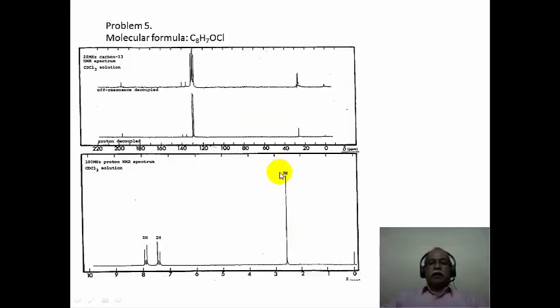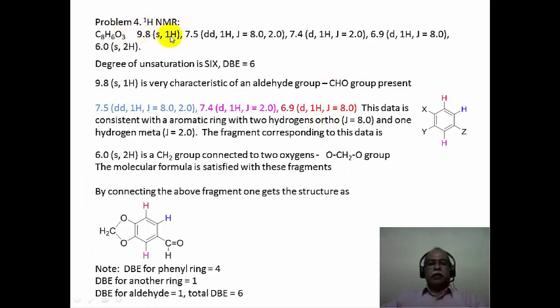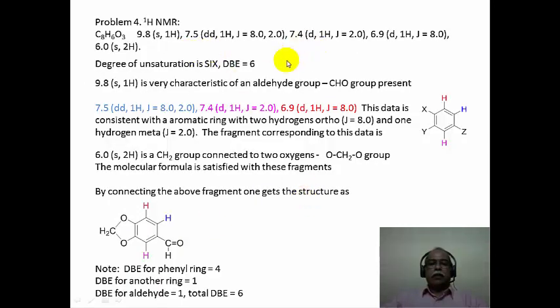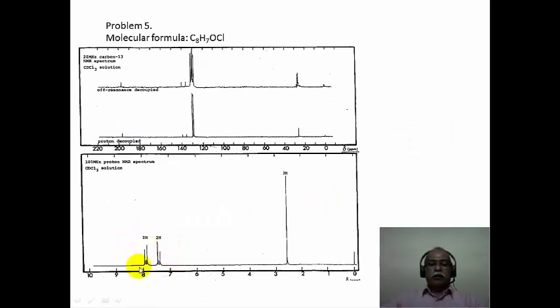Now this is another way of looking at the spectrum. Whenever a researcher is doing the research, he is not going to get the spectral data as it is presented in the numerical fashion like this. What he is going to get, of course, is a spectrum from the NMR spectrometer, and one needs to extract the information of coupling constants and the chemical shift values from the spectral data to be able to present this in this particular format. So if you take this spectrum, have a look at the spectrum in this region.